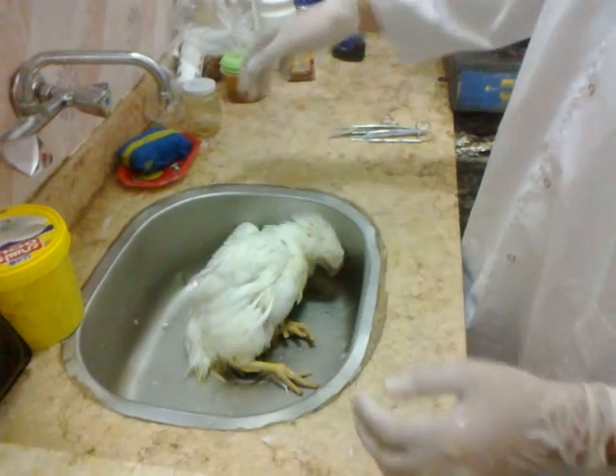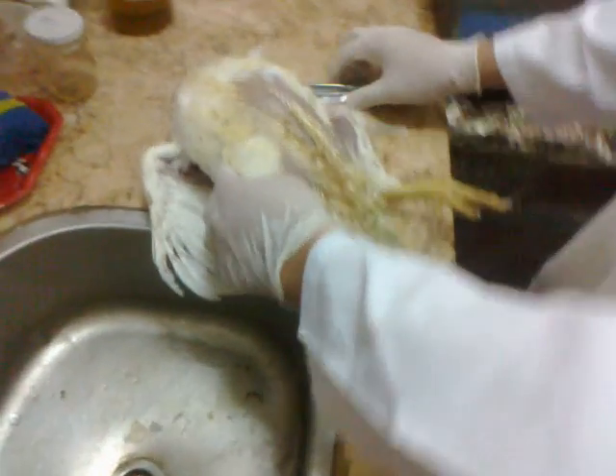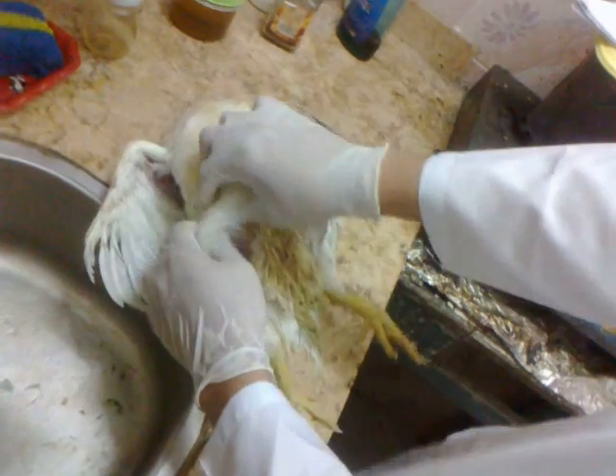Now it's completely dead. Dissection time. You have to note that this is a completely healthy chicken that we bought to demonstrate our scholar use.